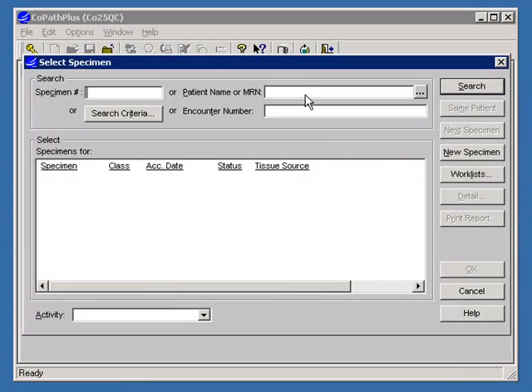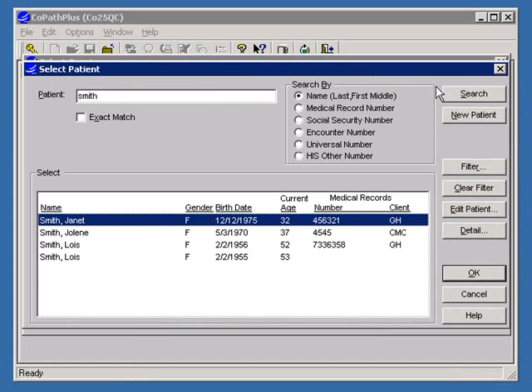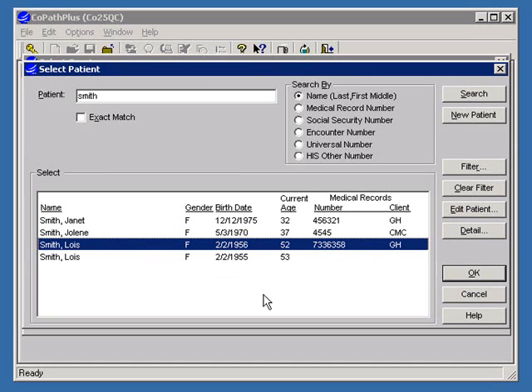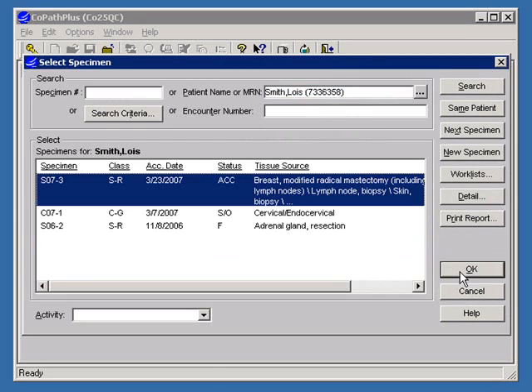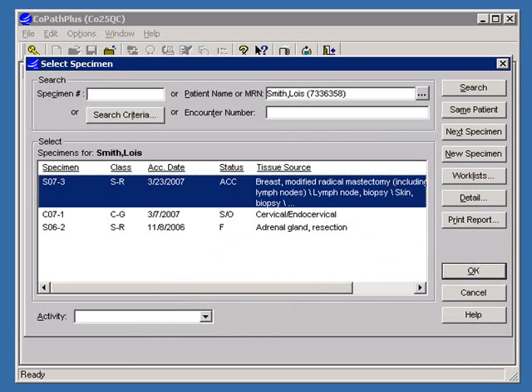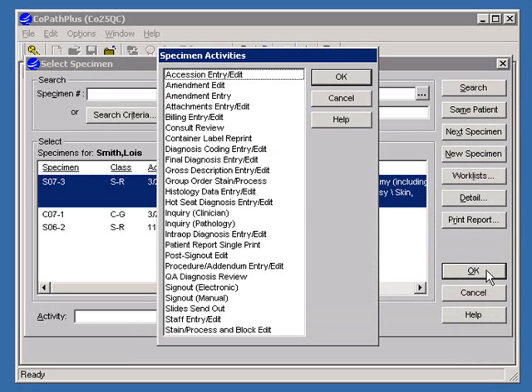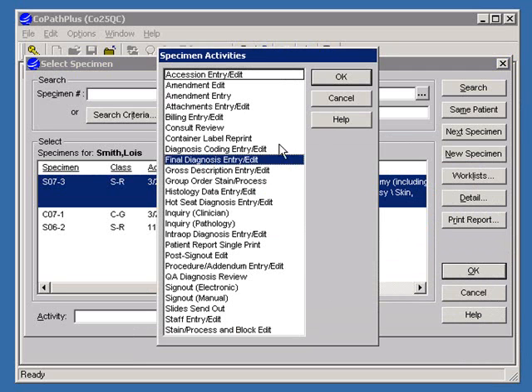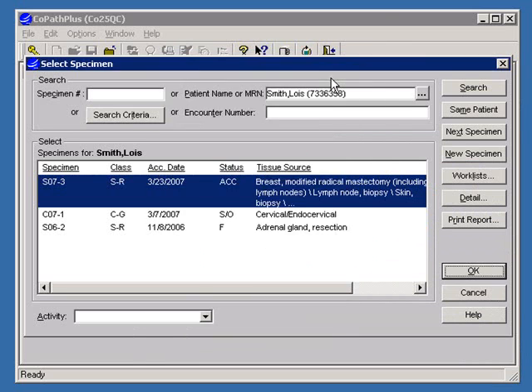Let's begin by searching for a patient by name. Here's the patient we're looking for. As you can see, these are the different specimens we can choose from. There are three specimens assigned to this case. The appropriate specimen is selected, so I'll click OK. And we'll select Final Diagnosis Entry/Edit and click OK.